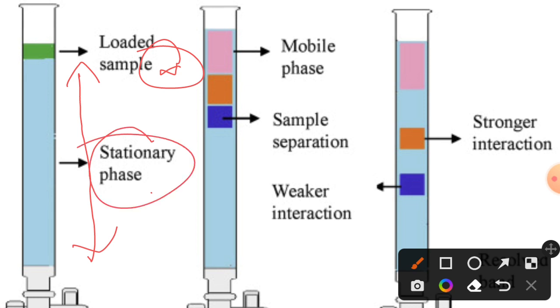That is the main concept of column chromatography: you are using a solid phase which is nothing but a porous solid matrix, and you have layered your mixture on the top of the column. Then your sample will percolate through the solid phase as an ever expanding band from the larger mobile phase, and separates on the basis of the particular property you are using for separation, okay.